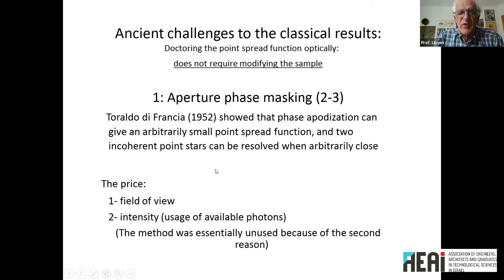So that's the telescopic side of it. Now, let's get to microscopy. Microscopy can be divided, as I showed in the very first slide, into several types of super resolution. The first one we'll talk about is important because it doesn't require modifying samples. The ones which got the Nobel Prize in 2014 involve modifying the sample, and that's a disadvantage, which I hope will be overcome in a significant way in the future. They were modified by making them fluorescent with fluorescent dyes, which modify the sample. Something which is living is probably killed by them.